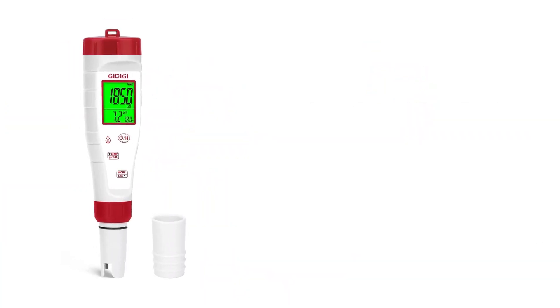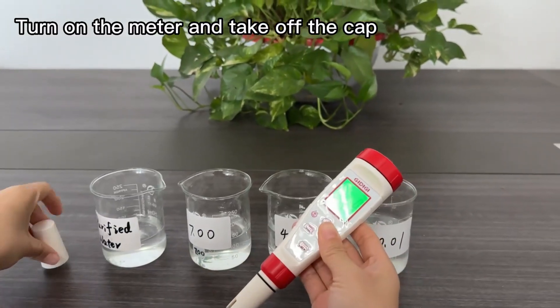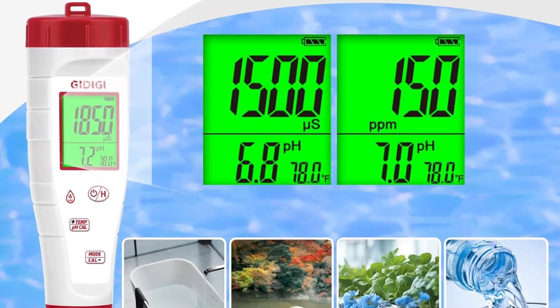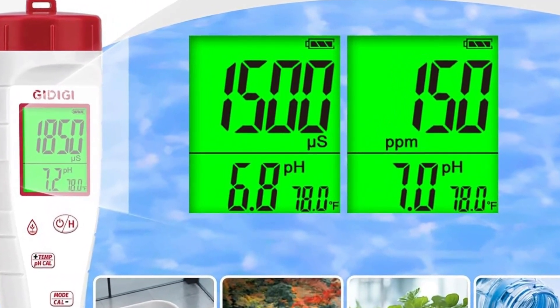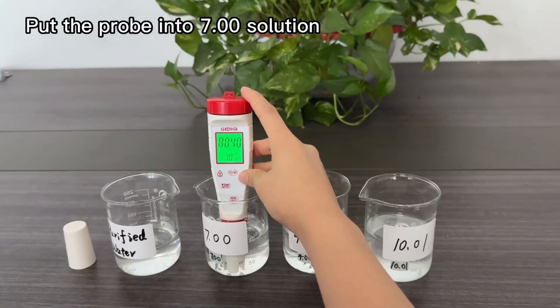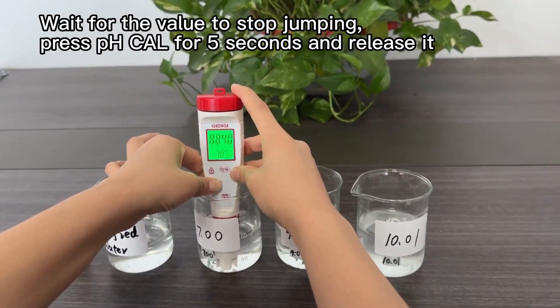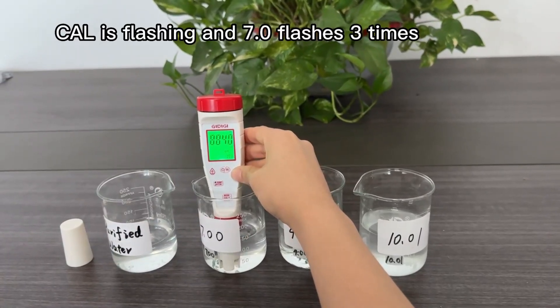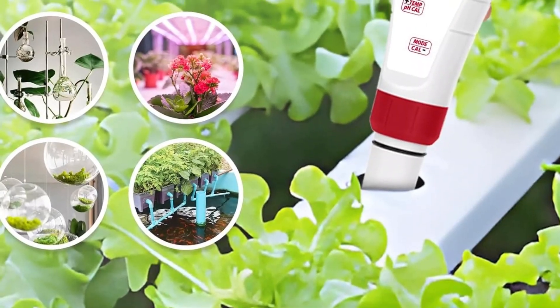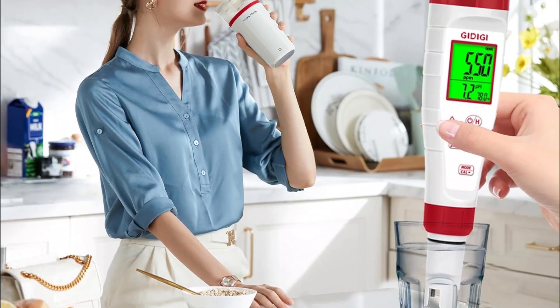Number three: the 4-in-1 pH meter. If you're starting in the world of pH and TDS and want a simple, all-in-one, easy-to-read tool, then this 4-in-1 pH meter is for you. It measures pH, TDS, and temperature simultaneously on a clear backlit screen. If you have no prior experience, this meter is designed to be intuitive — just immerse it and you'll have readings in seconds. It has a comfortable grip body and an updated appearance. It's perfect for home applications like drinking water, swimming pools, irrigation systems, or plant nutrients, adapting to different needs.